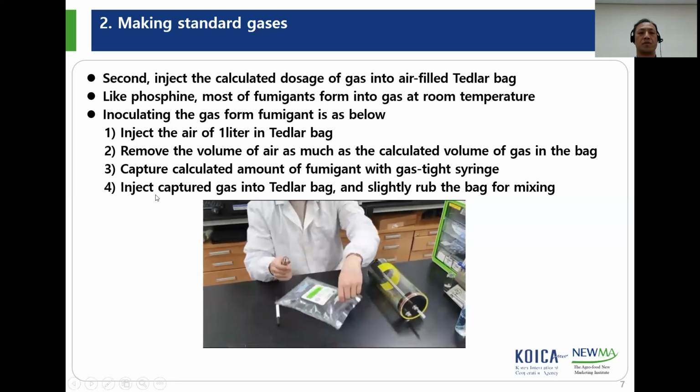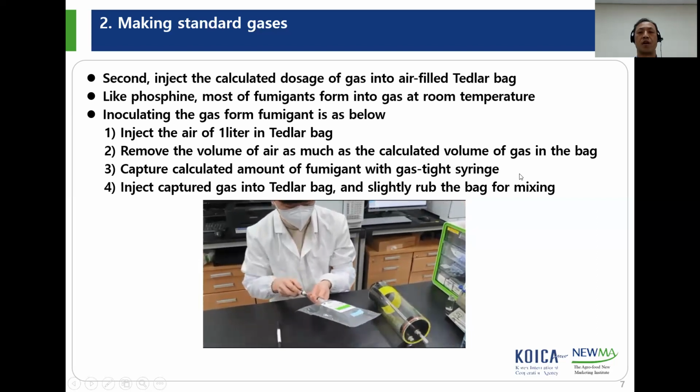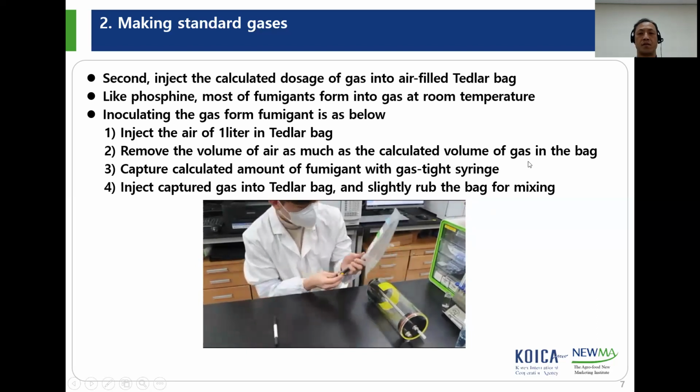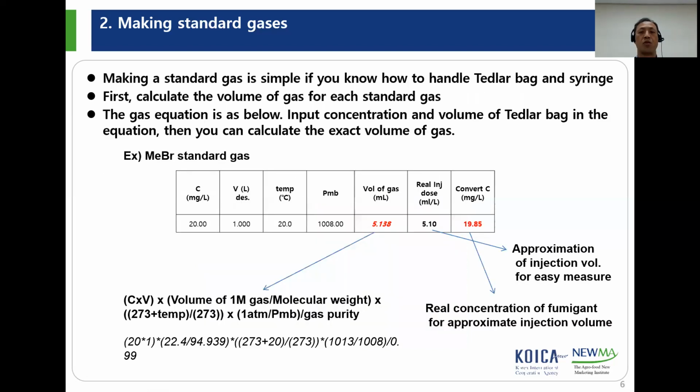Remove the volume of air from the bag as much as the calculated volume of gas. The calculated volume of gas is calculated in this Excel table, this one.